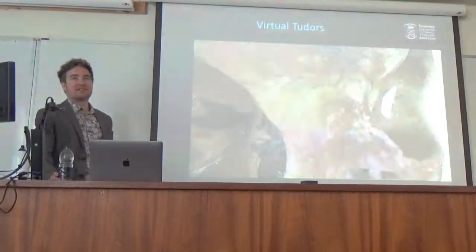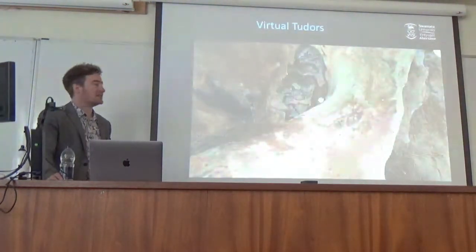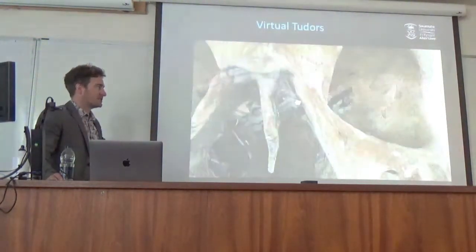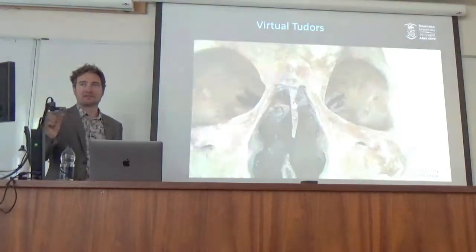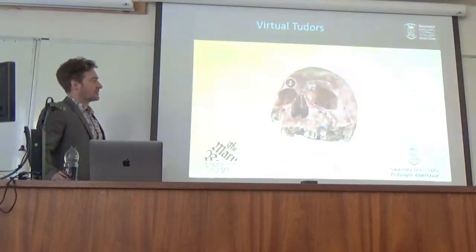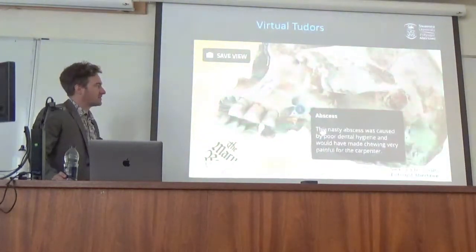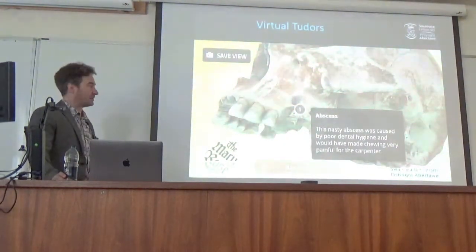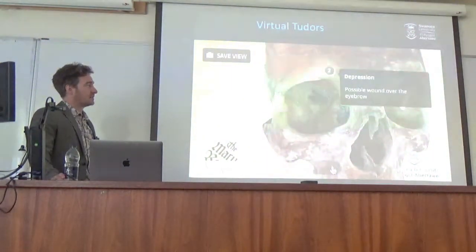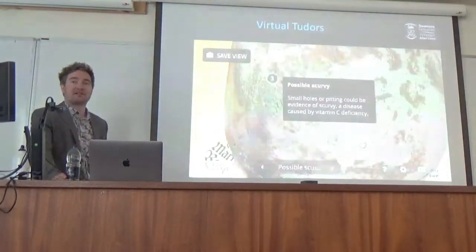So there's the quality of the photogrammetry work that Sarah did. You can do overall measurements, and there'll be a certain error with photogrammetry compared to laser, compared to x-ray. But actually a lot of the features are about texture, looking for an abscess or cratering in the skull. So there's a lot of analysis that can be done on the virtual.